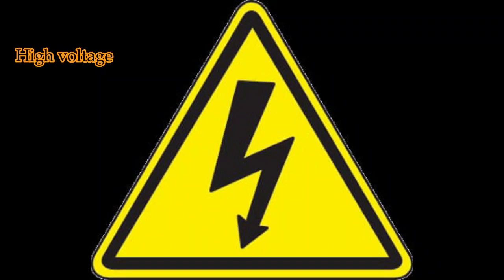Voltage. The high voltage warning symbol, which includes a lightning bolt arrow in a yellow triangle, warns of voltage high enough to cause serious injury or death in general. Stay safe. You should stay away from equipment or areas of the lab marked with this symbol. So, if you do need to work close to such hazards, protective clothing and rubber gloves should be worn.